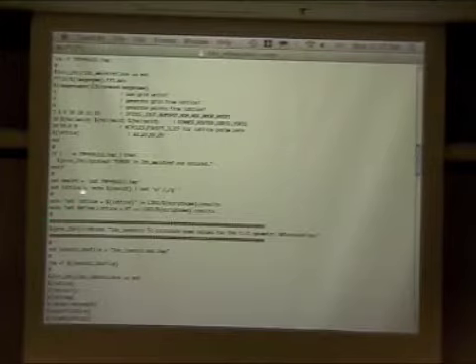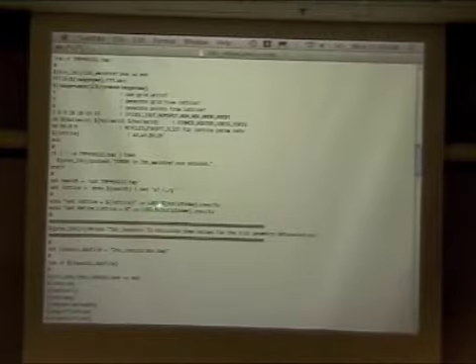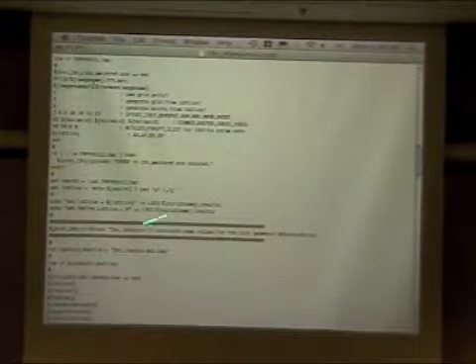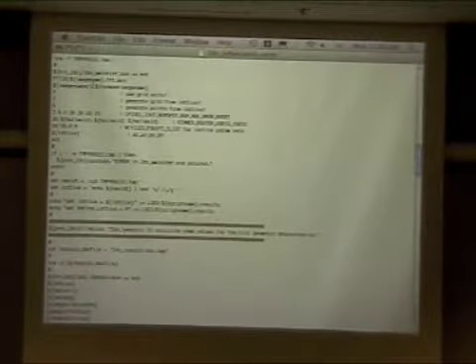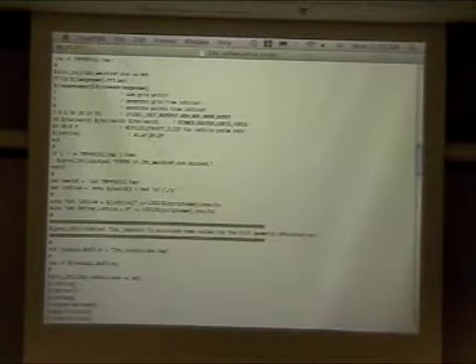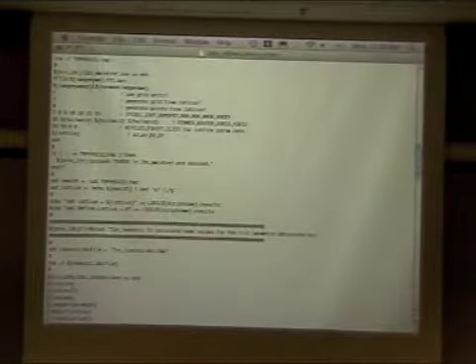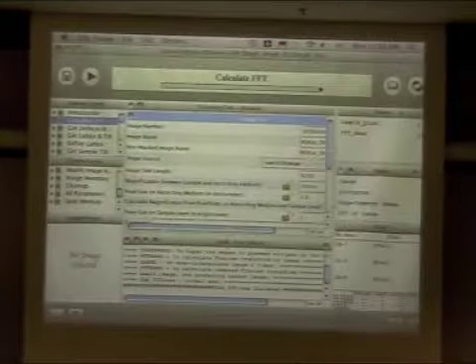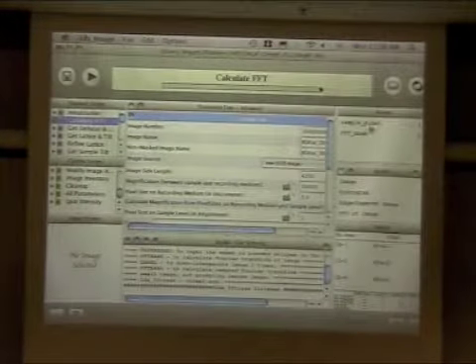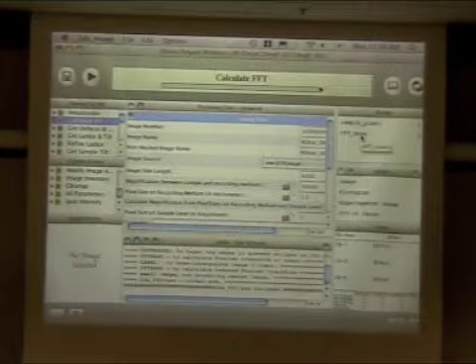So what we do is we echo set lattice equals to whatever your new value is, and we echo that out to the logs directory / the name of our script, which in this case is 2dx_refined lattice. We just defined it as a variable, .results. And so 2DX sits there also monitoring the logs directory, and also monitoring these files. As soon as they're created, they're parsed. And if they find anything that says set blah equals blah, then they show up here in the results. And so you can see after calculating FFT, there are two values that were changed. That was all in this log file and just automatically interpreted.